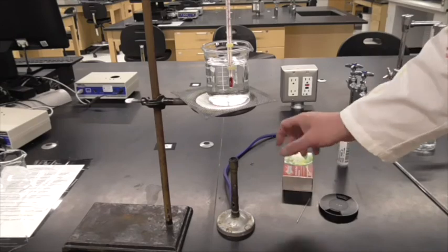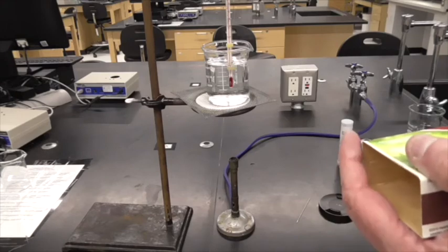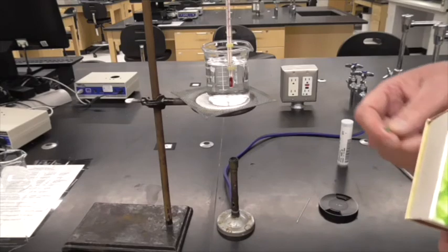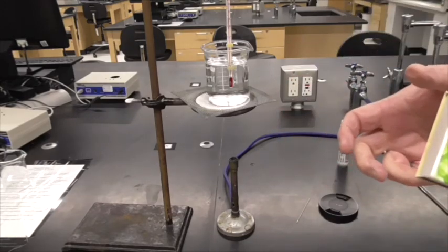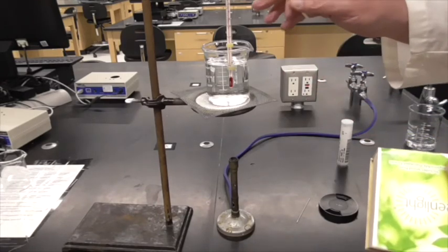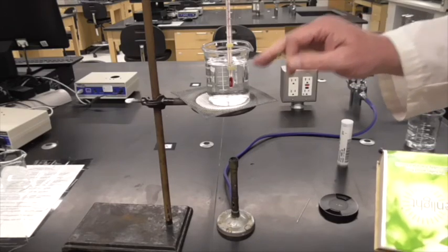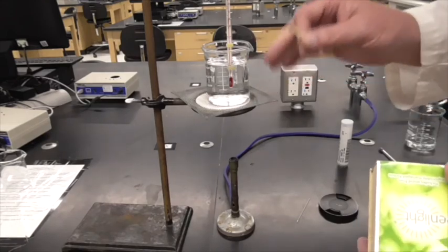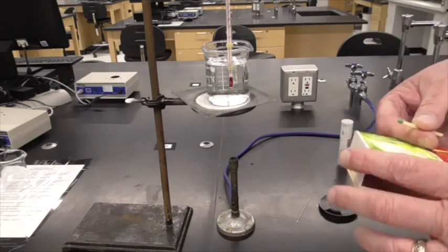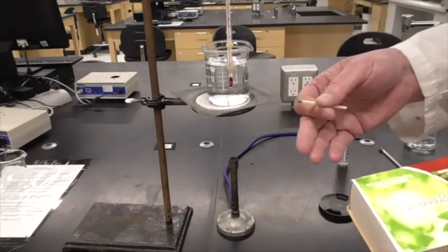So I'm going to light this so you can see that, and then I'm going to focus on the thermometer, and I'll have another camera watching the sample. What you want to do is get a range of temperatures. We're going to heat this really quickly so you get some idea where it goes, but you want to watch it so when you first start seeing it melting, you need to write the temperature down, and then when it's all converted to liquid, you need to write the temperature down. Okay? When we do melting points, we do ranges. From when it first starts to melt to when it's all melted.